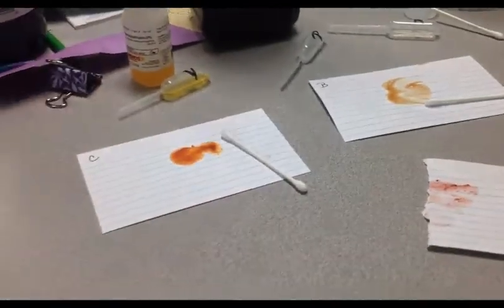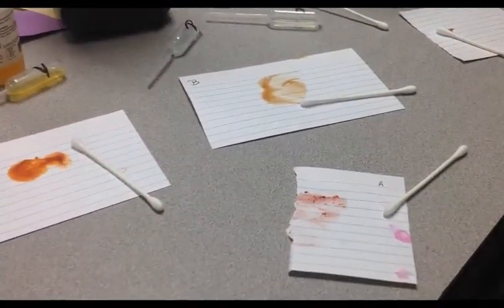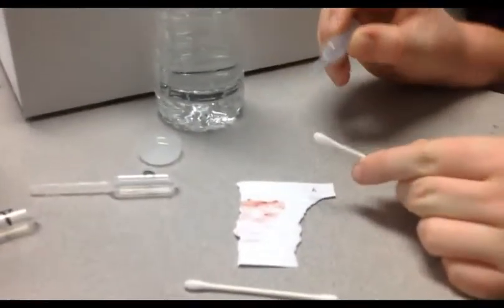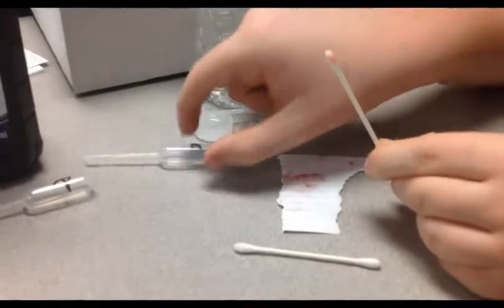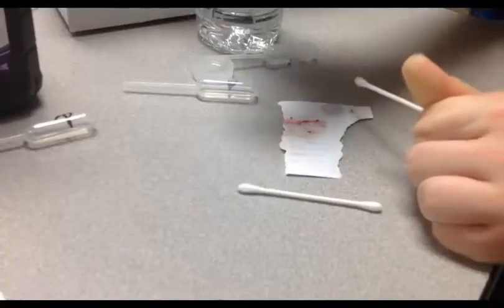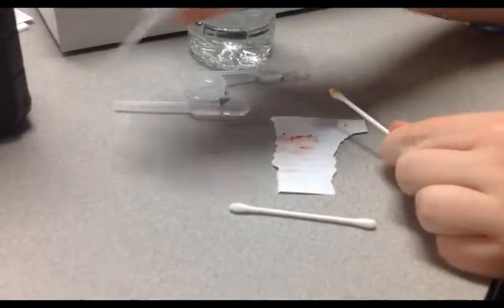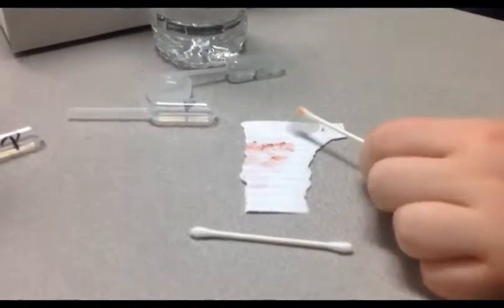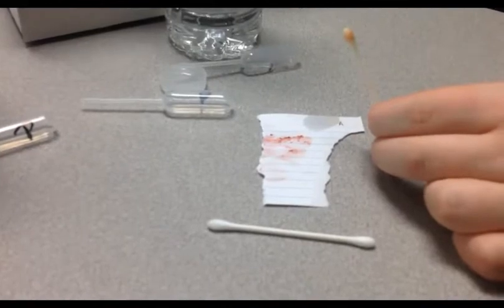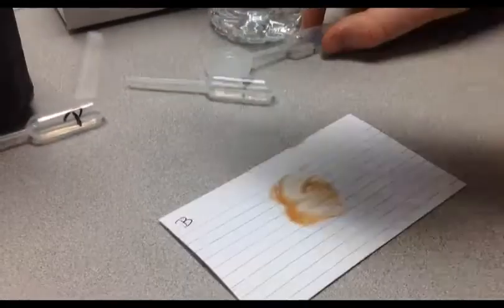We have 4 samples, A, B, C, and D. We're going to see which one's blood. So now we begin by getting it wet. Now we add alcohol. From the alcohol, phenolphthalein is added. And then after the phenolphthalein, the hydrogen peroxide. Okay. Notice how it didn't change color. So that is a negative test. That is not blood. Now we move on to the next one.